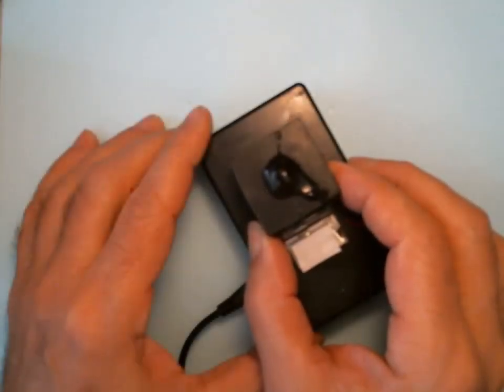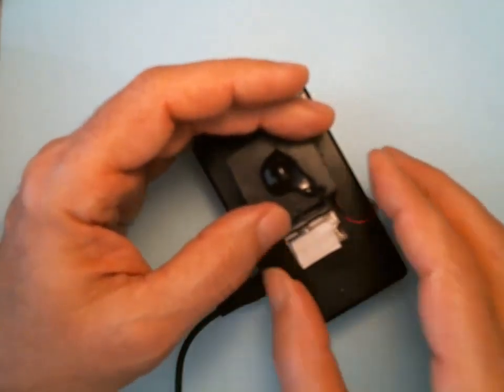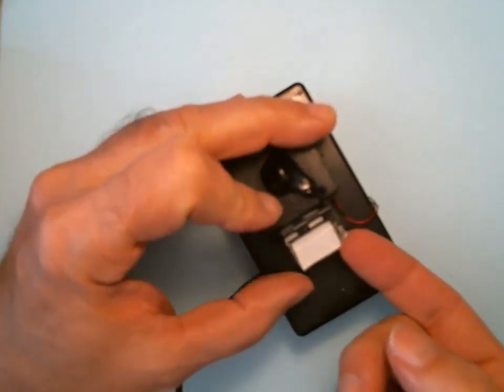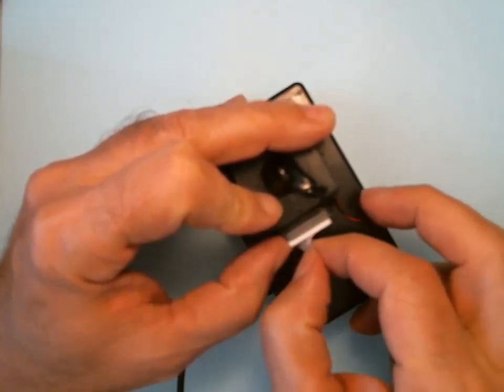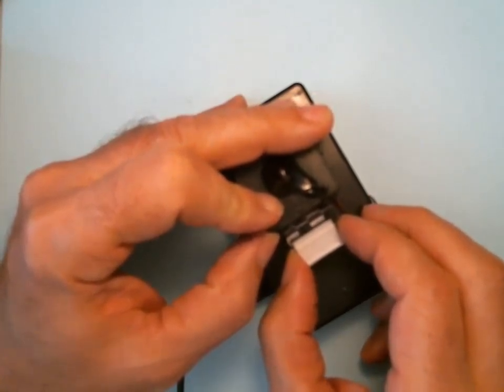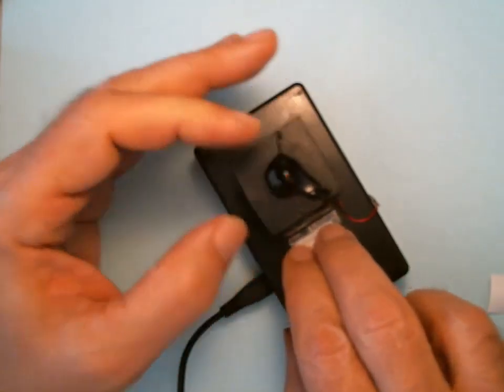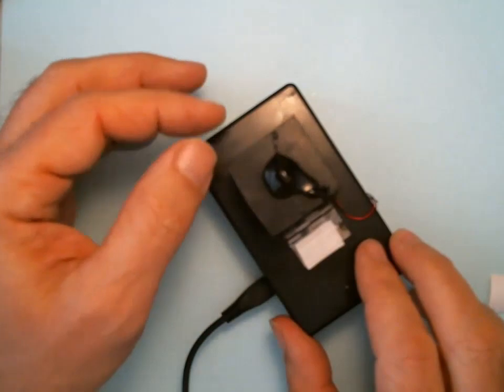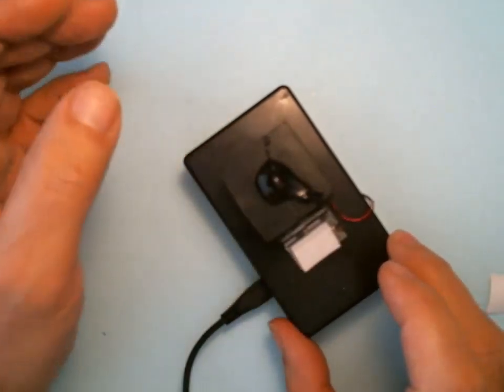And right about here, you want an even illumination across the whole image. And once you have that, hold it in place. Take the double stick, the protecting film off, and do one last check. That looks good. And then just anchor this down. Just push hard, and you'll notice now you can load your sample and put your cap down.